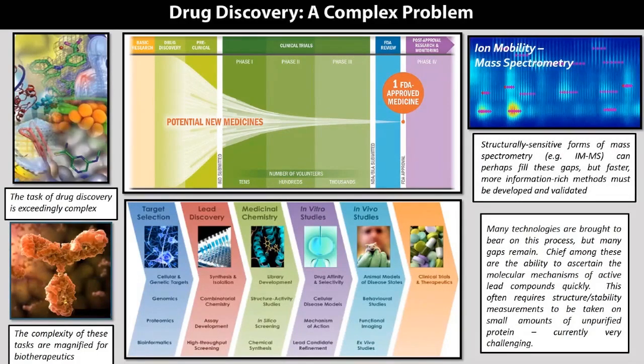So my group is really aiming at trying to develop ion mobility mass spectrometry to assess some of these challenges. And I'm going to introduce this technology to you as well as push it forward and give you some data to think about in the context of how it's being used right now in my laboratory to address both biotherapeutics as well as some small molecule drug discovery type applications.